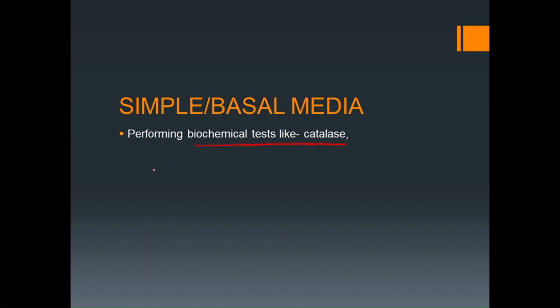We have a fixed amount of, let us say, agar. After that, we just make our media out of it. This simple media doesn't contain anything extra in it. It is just a simple media, just to grow microorganisms.